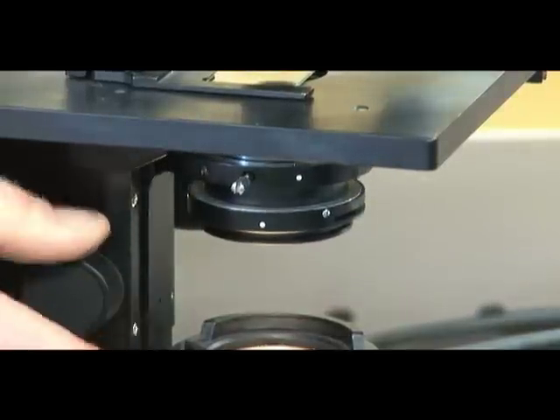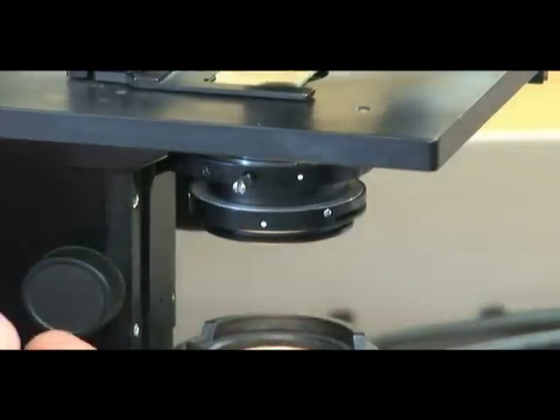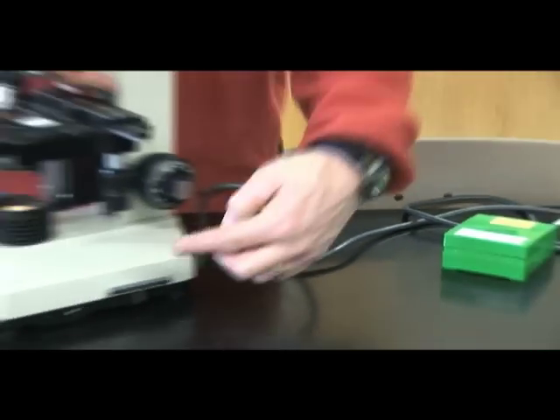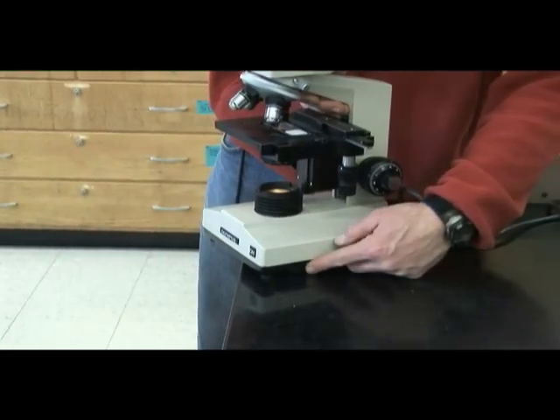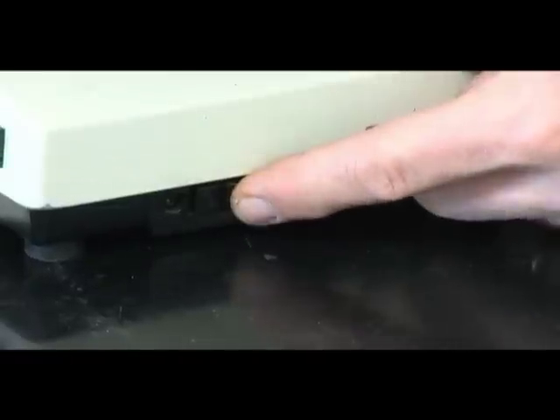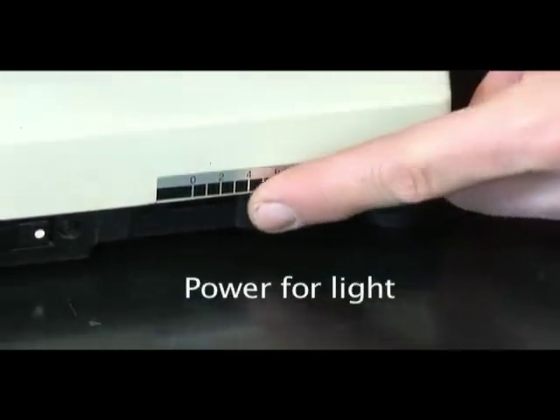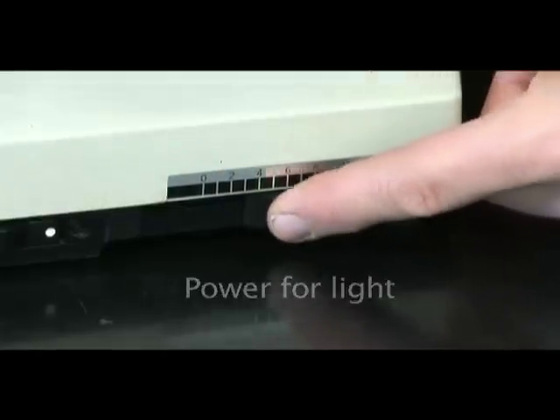And just to show you how that operates, you can see now the light source at the very bottom. The base of the microscope is where the switch to turn the unit on is, right here. So when we press it down, the light comes on. There's also a slider that's useful to increase or decrease the amount of light that's coming through.